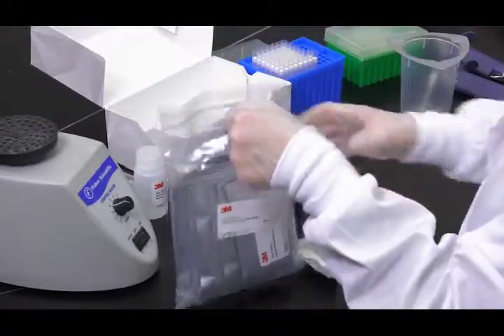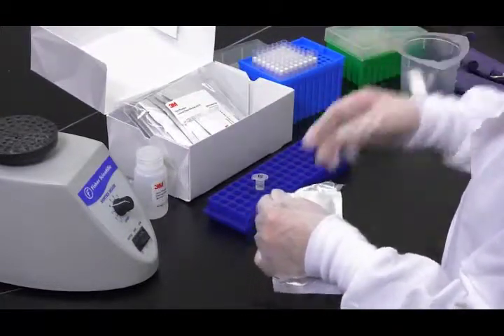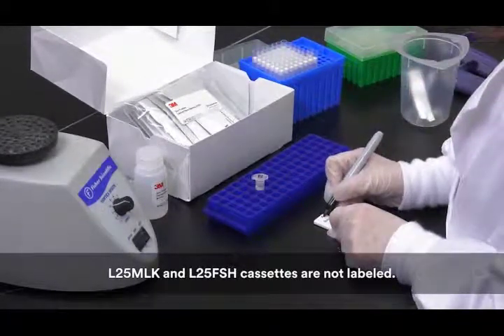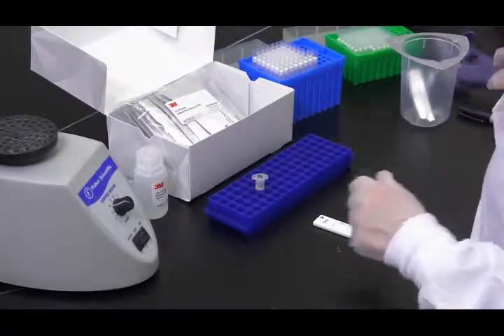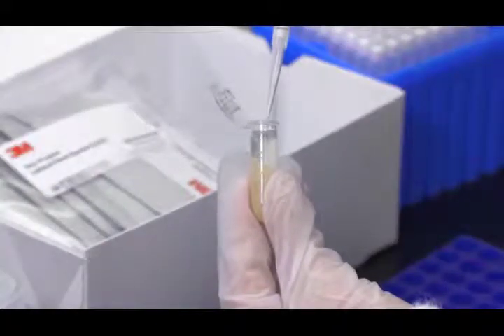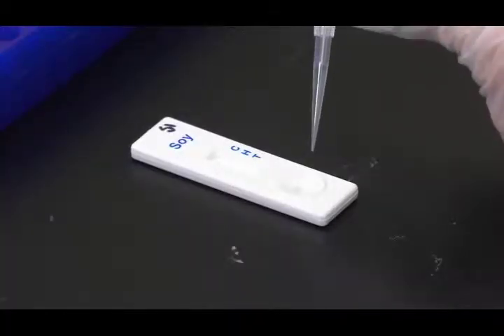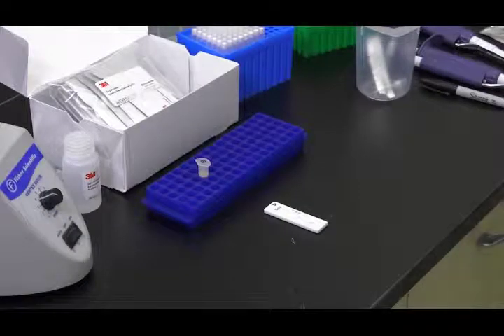Then remove one 3M allergen protein lateral flow device from the package and place it on a clean, dry, flat surface. Each cassette is labeled with the specific analyte for easy identification. Label the cassette with the appropriate sample ID. Transfer 100 microliters of the extracted sample from the middle aqueous layer using a clean pipette or pipette tip, apply it to the sample well on the 3M allergen protein lateral flow device, and start the timer for 11 minutes.